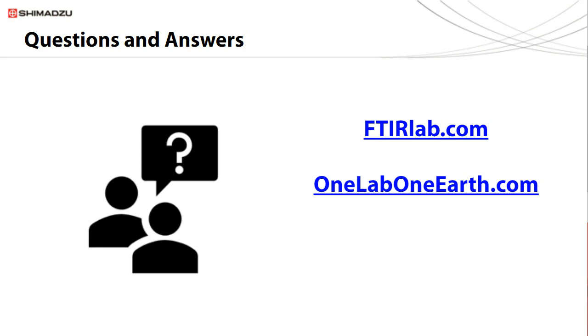All right, actually I see a question that is probably better answered by Ruth. So here it goes. Is there a formal established definition of microplastics? Thanks, Sudhir, for that question. As mentioned during the seminar, microplastics are a very diverse type of contaminants, and there are several parameters that can be measured. There has been a lot of effort across different disciplines and countries to try to standardize a definition of microplastics.